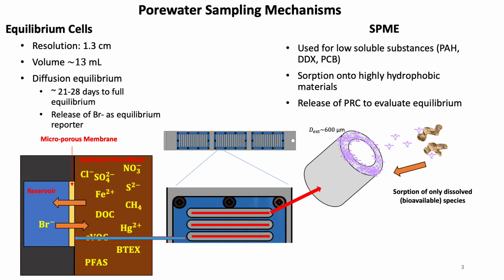And there are many more details on SPME sampling for sediments in other publications or presentations. This is an existing technique that has been well demonstrated and essentially been adapted to be able to apply the SPME fibers in a horizontal as opposed to vertical orientation, which allows you to get more SPME length per depth, which gives a lower detection limit and allows a higher resolution of sample analysis.